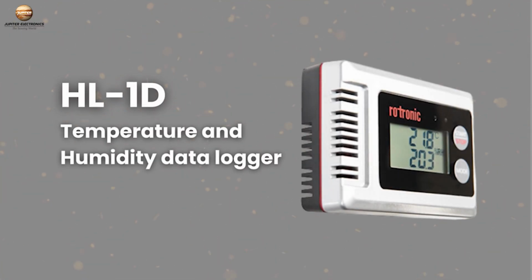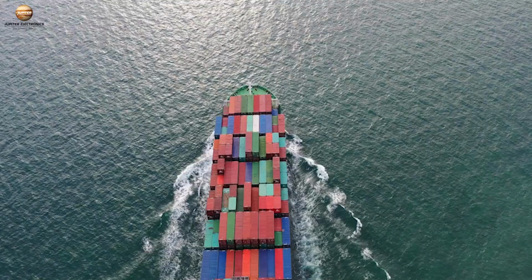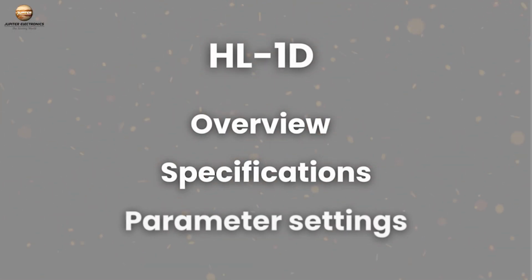Today we are introducing the HL-1D temperature and humidity data logger offered by Rotronics. The HL-1D is a portable humidity and temperature data logger that can be used in cold chain logistics, pharmaceutical industries, and HVAC industries. The HL-1D is particularly utilized in logistics and the pharmaceutical industry due to its specifications and the information it provides to the user. In this video, we will give you an overview of the HL-1D, its specifications, and the detailed user parameter settings. First, let's talk about the overview.